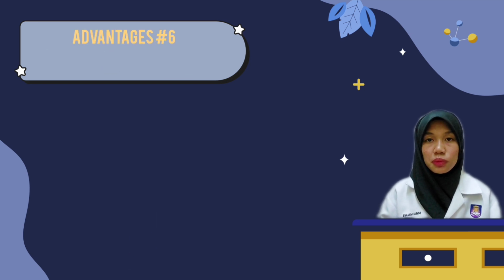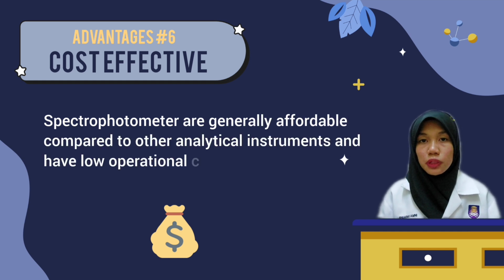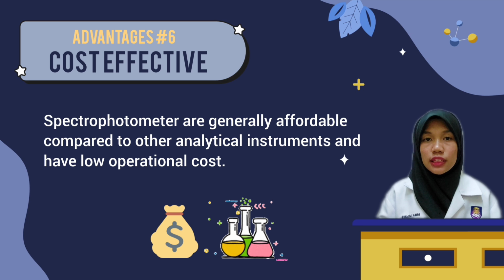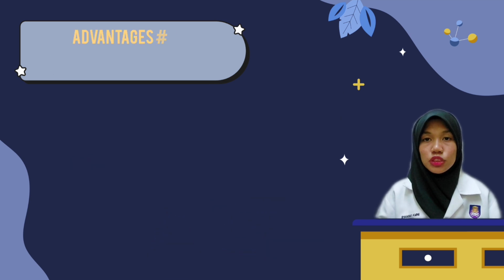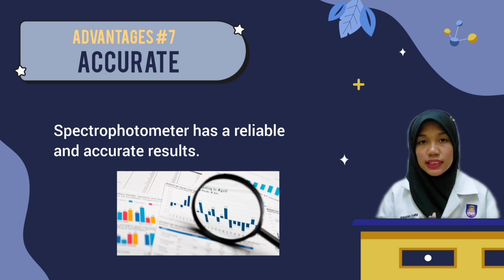Sixth, spectrophotometer is cost-effective. Spectrophotometer are generally affordable compared to other analytical instruments and have low operational cost. Last and most importantly, spectrophotometer has a reliable accuracy.